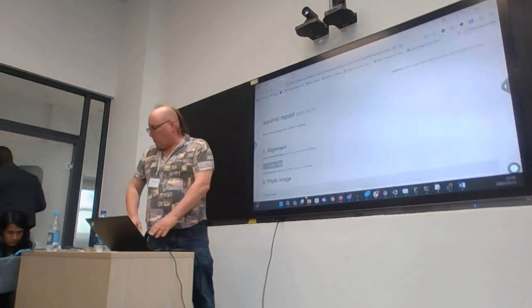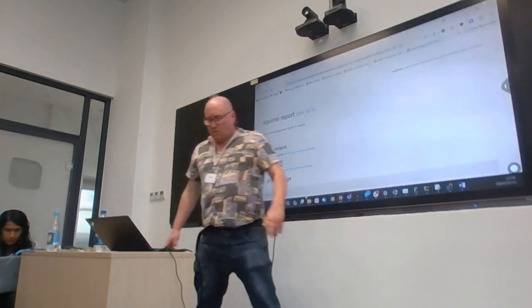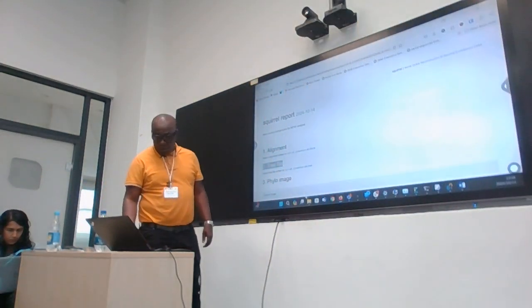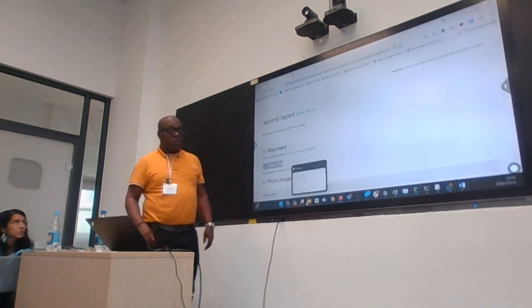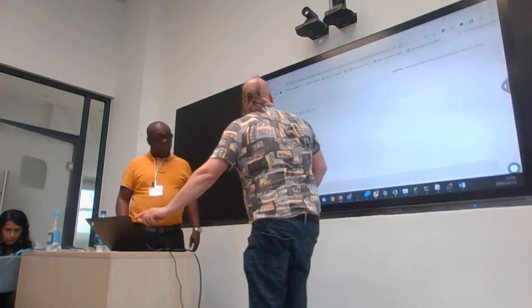You choose where to go. You can just use left and right arrows here. Oh, not a catch. Just choose which parts you want to go over. Wait, what happened? Oh, look.